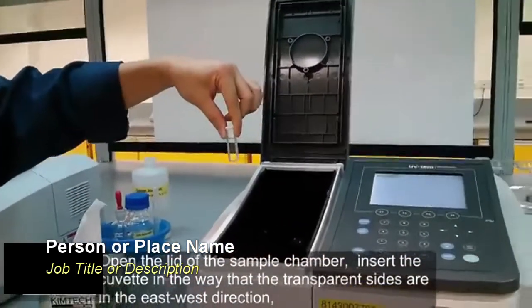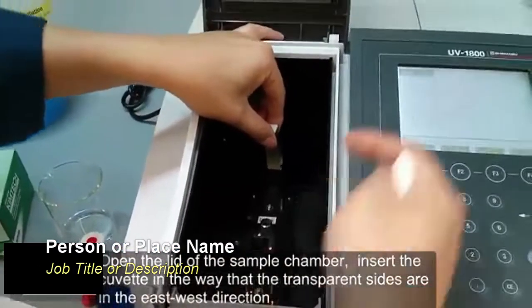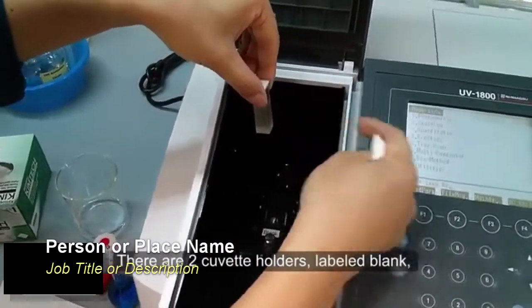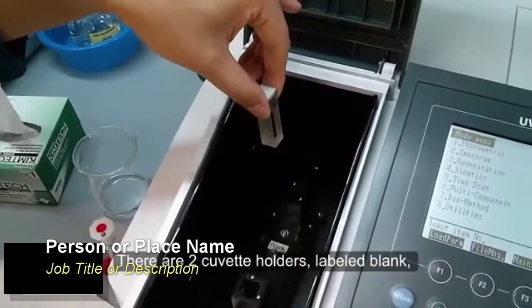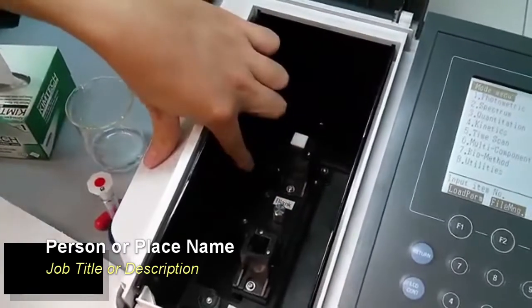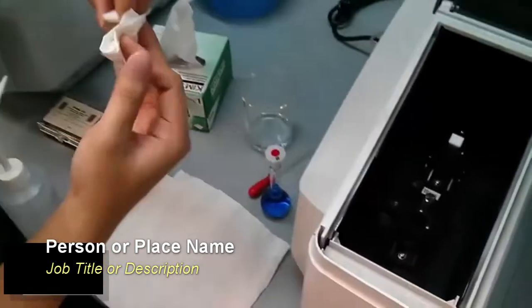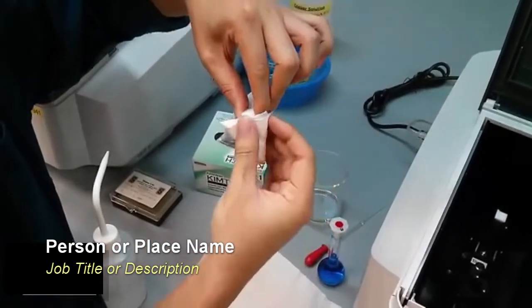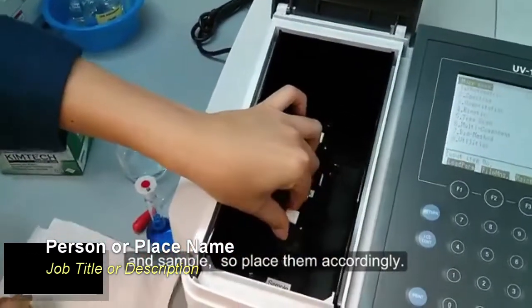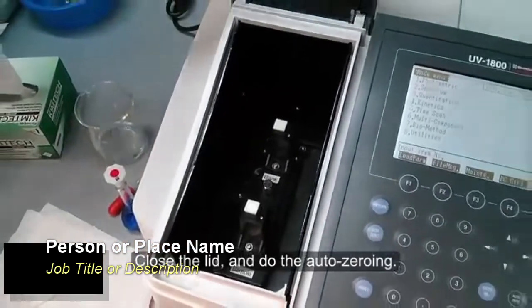Open the lid of the sample chamber. Insert the cuvette in a way that the transparent sides are in the east-west direction. That's where the light is coming from. There are two cuvette holders labeled blank and sample, so place them accordingly. Close the lid and do the auto zeroing.